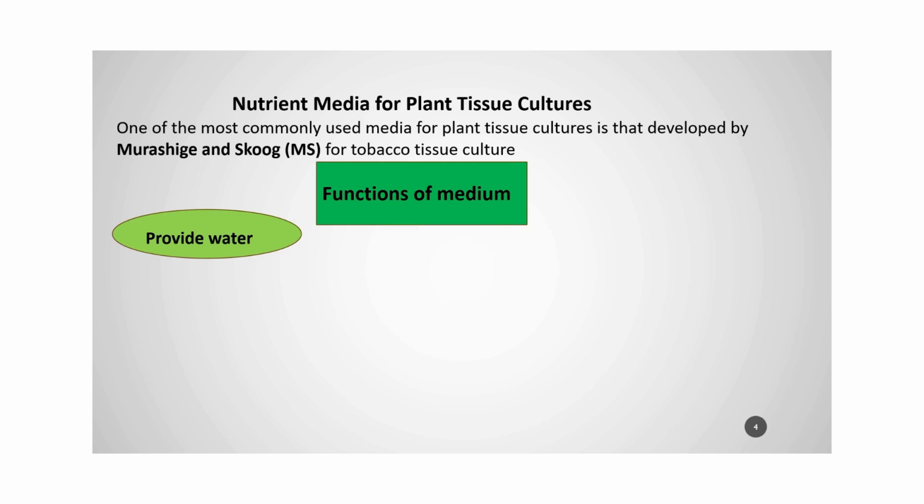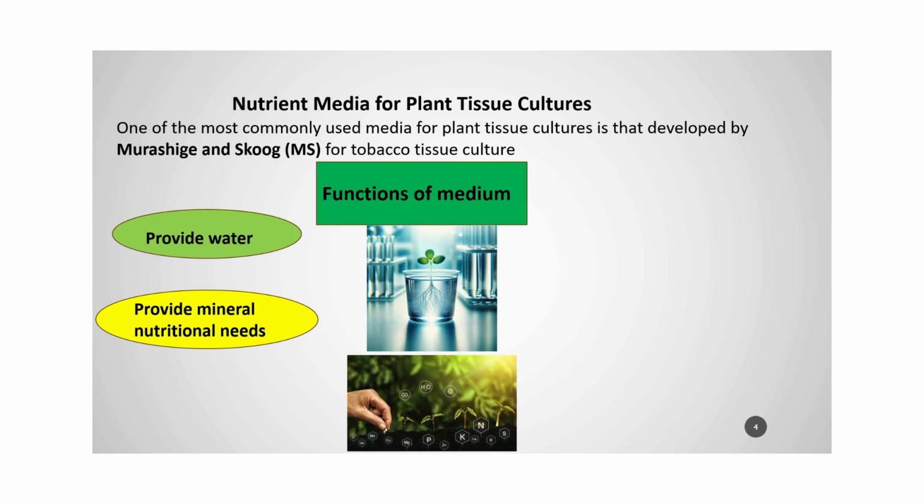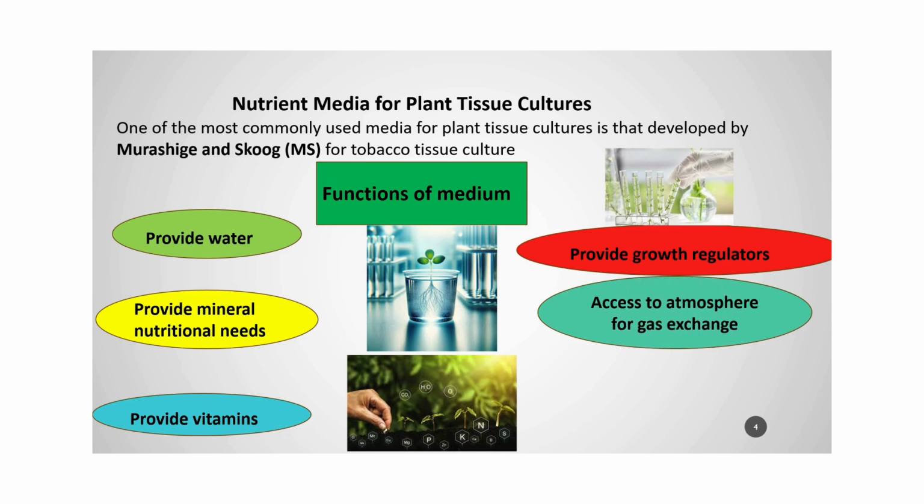The functions of media: first, to provide water, provide minerals, nutritional needs, provide vitamins, provide growth regulators, and access to the atmosphere for gas exchange, and removal of plant metabolite waste. These are all the functions of media which will be provided for the tissue culture.